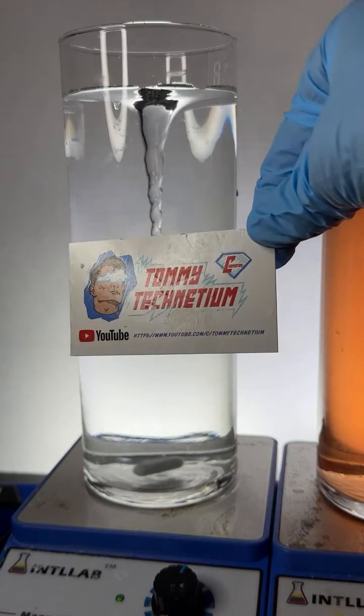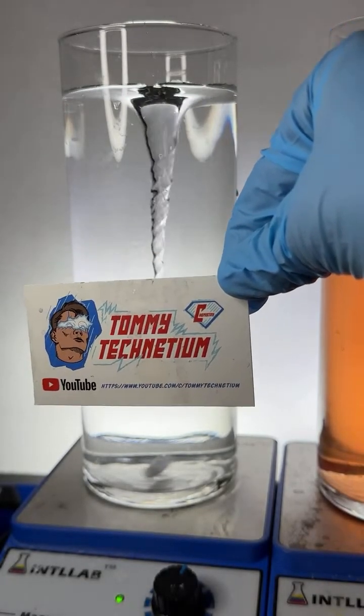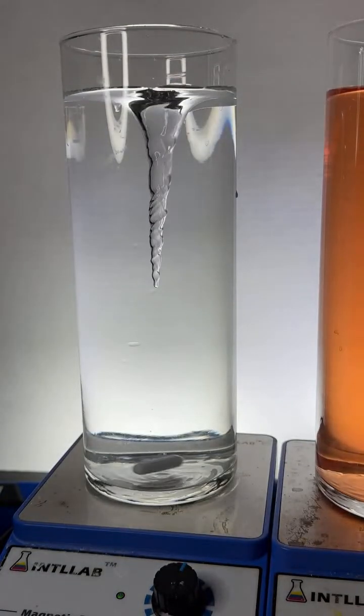Yes, it is distilled water, Katie. So, I do some experiments with, we'll say, light explosives. Yep, that's distilled water.